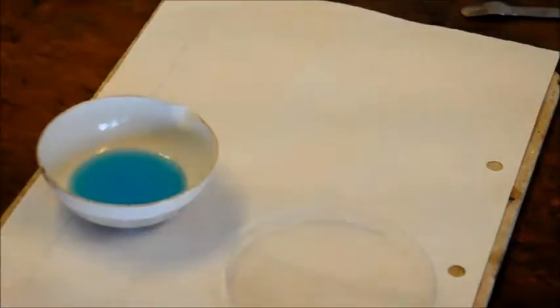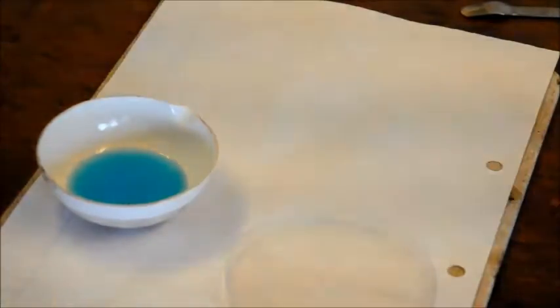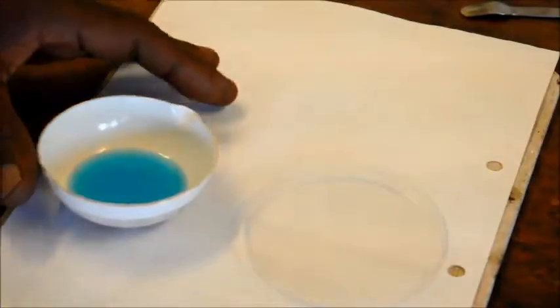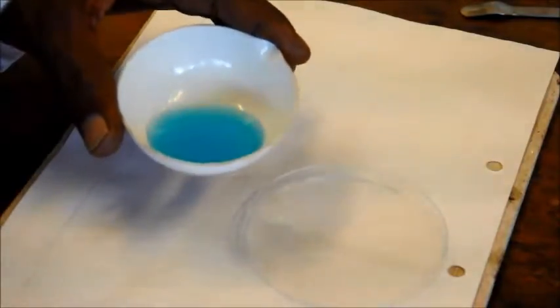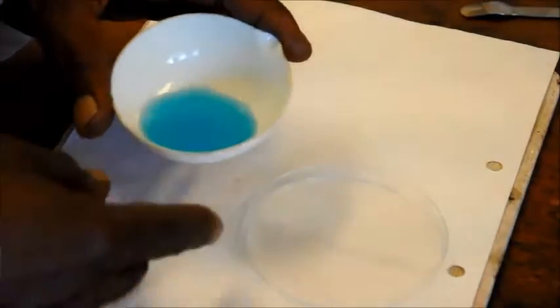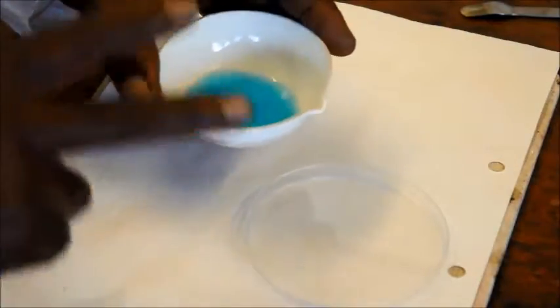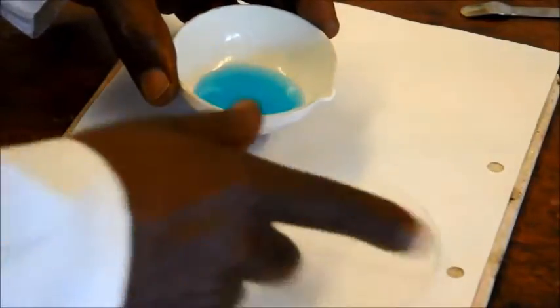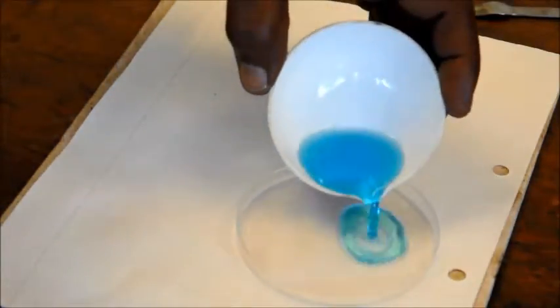Okay. Once the heating apparatus has cooled sufficiently for you to be able to move it around and get rid of the stuff you don't need anymore, you'll be left with your evaporating basin with a small amount of concentrated copper sulfate solution. What you've done when you've evaporated is you have driven off a lot of the water, and what you're left is a more concentrated solution. You could use a crystallizing dish. We're using this plastic dish as that, and it's a simple matter of just pouring that in there.